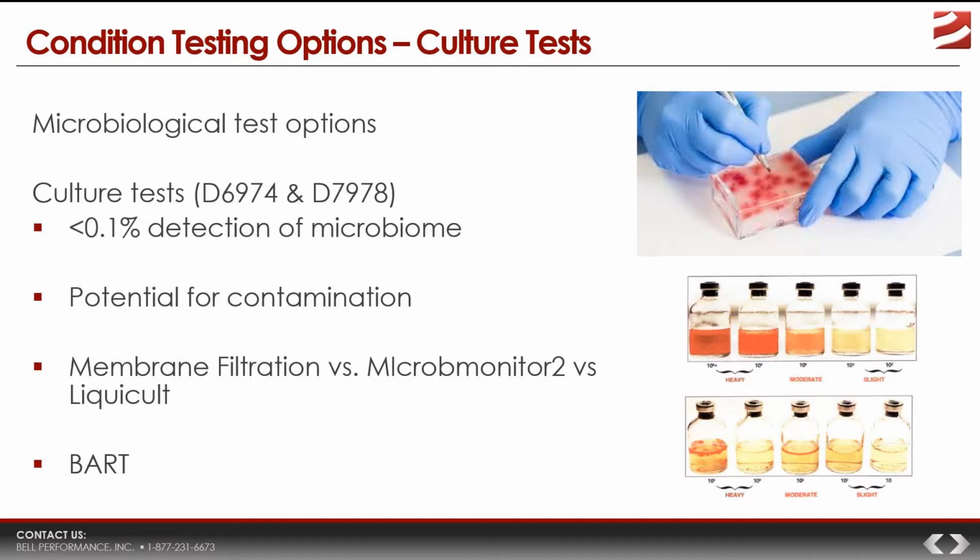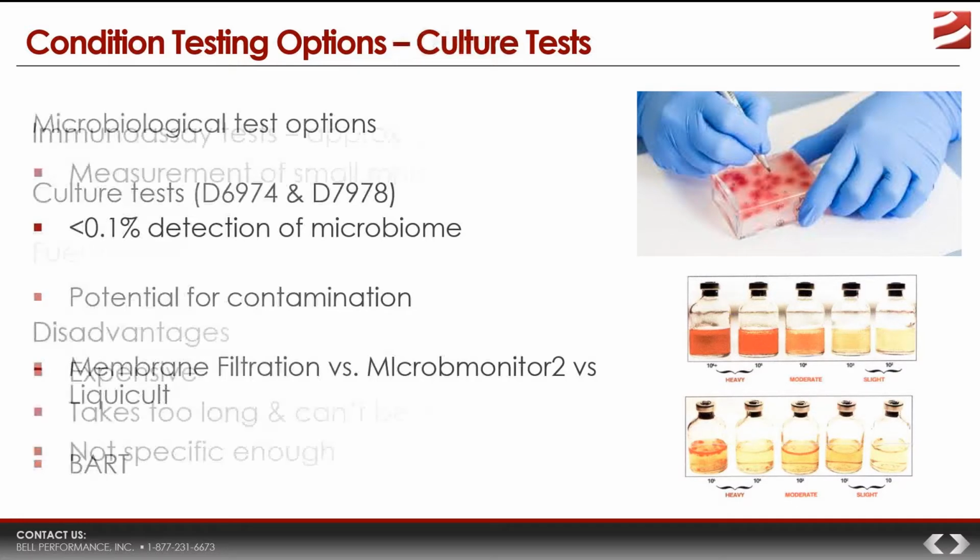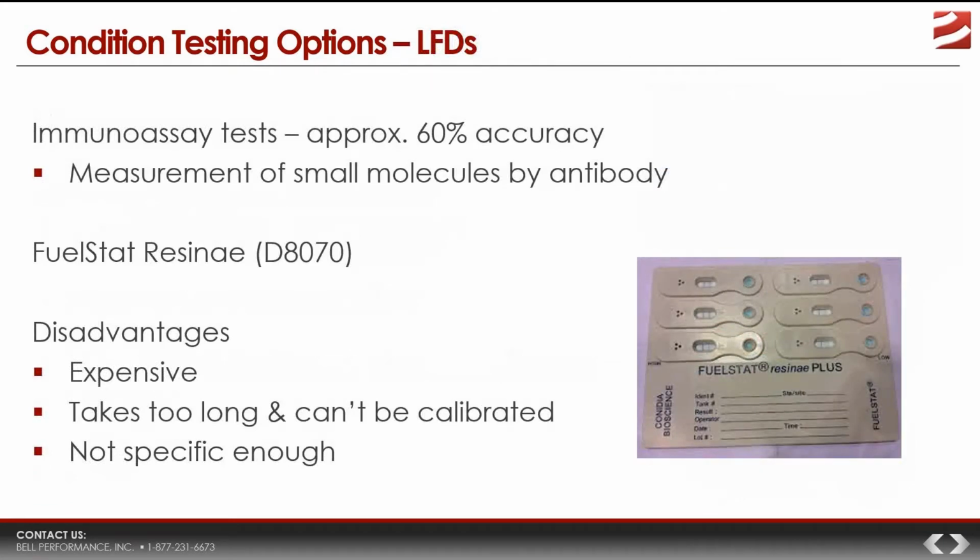So if you've got a culture test and you wait 3 days for it to incubate, how do you know if what you're seeing really does represent your microbial biome? If a significant number of those microbes that came in the sample are still in the process of growing, you don't really know, and you don't really have a meaningful way of knowing either. And so that kind of limits the usefulness.